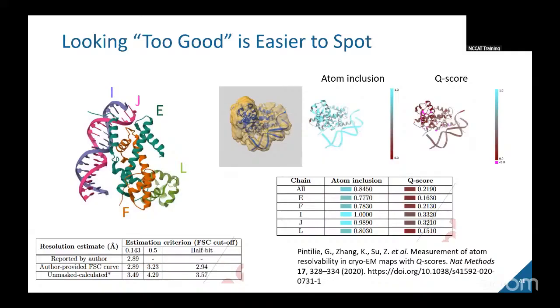If you were in that range, what would you say? Would you say, oh, this Q-score is borderline? Well, it's resolution dependent. I have a slide actually. I think I can get to that in a bit, when I emphasize ligands. We'll get there very soon. Is there another question?